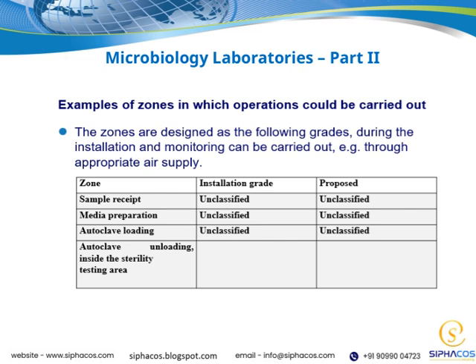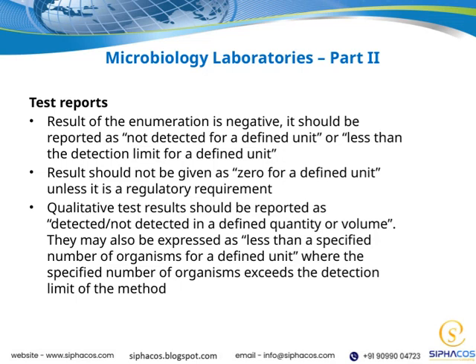Throughout this part of the presentation, keep in mind how these laboratory processes connect to overall patient care, emphasizing the importance of accuracy, speed, and proper technique in microbiology labs. When reviewing test reports, it's important to understand how the results are communicated.